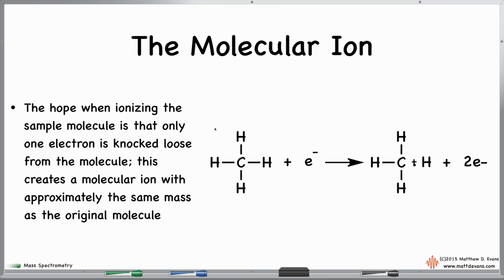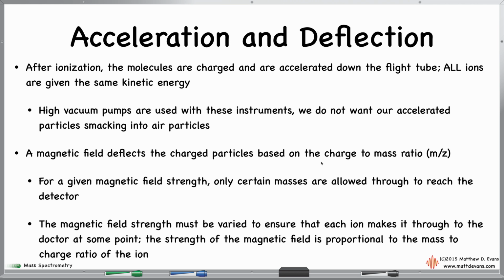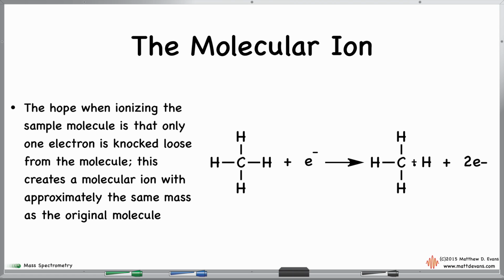So we've just loaded, well, we wouldn't do this for real, but here's methane. Methane's a gas. It'd be really hard to do this. But methane, we hit it with, I apologize. Let me back up. We hit methane with a high energy electron. It smashes into this methane molecule. And the hope is that this electron knocks loose one of these electrons, making this bond right here.